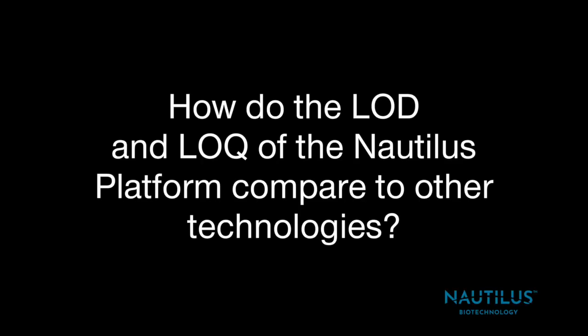Our next question asks about how does the limit of detection and the limit of quantification of the Nautilus platform compare to other technologies? First off, I want to say that this is an incredibly deep question, and it's important before diving in to really take a step back and define what do we mean by limit of detection and limit of quantification.